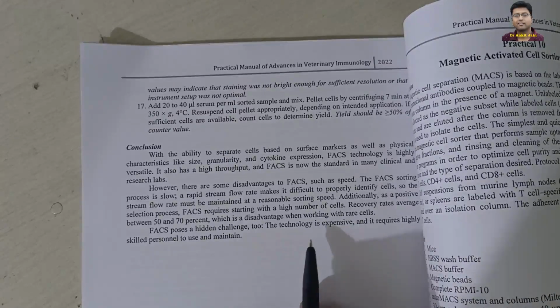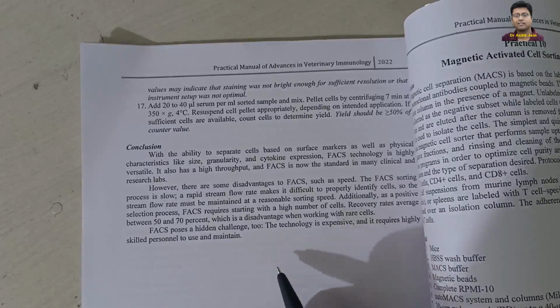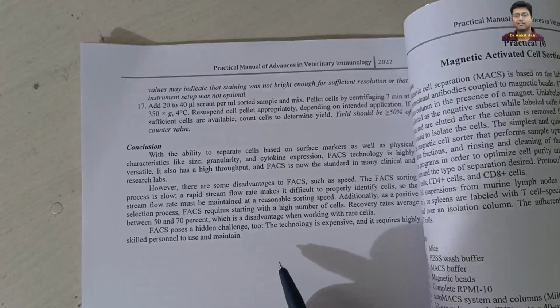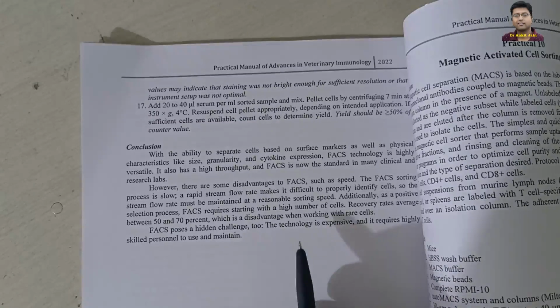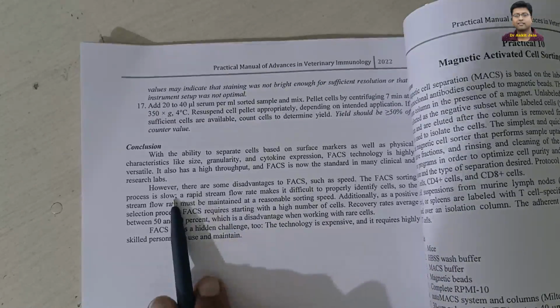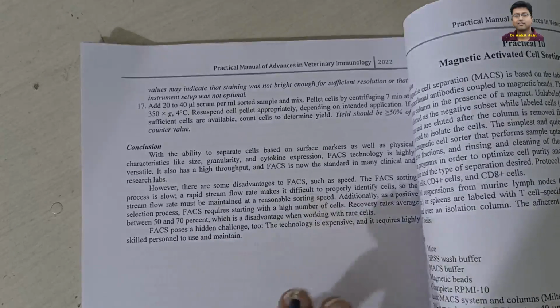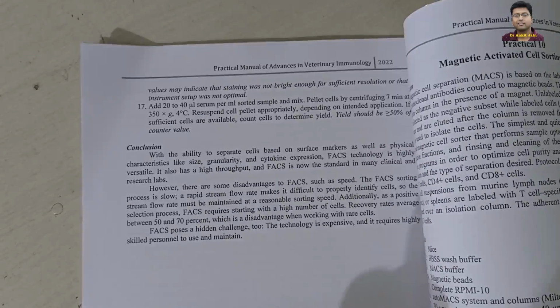तो डिसएडवांटेज ये है कि this technology is very expensive and it requires higher skilled personnel. Second, third है the speed of cell sorting is very low, it is very slow. So these are the main disadvantages of this FACS.